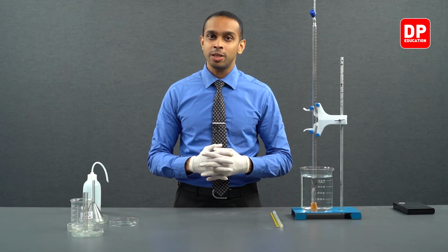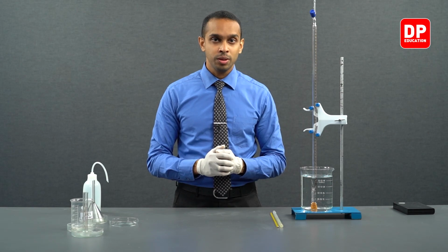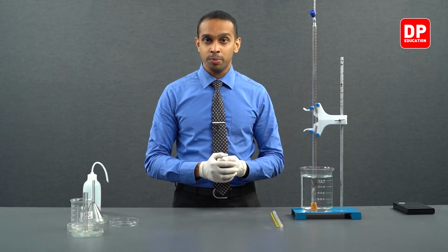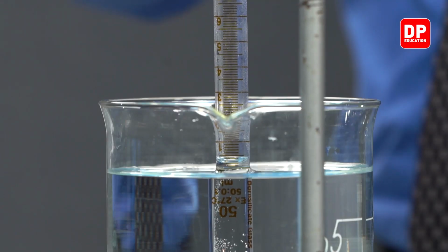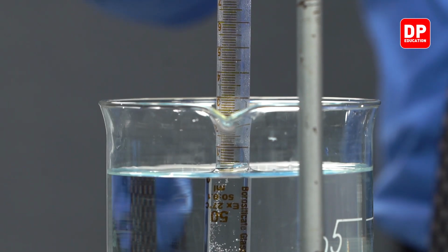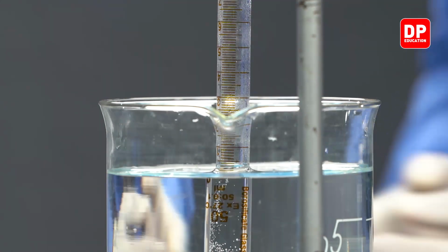Like I mentioned in the previous two trials, this volume is not the correct volume because the pressure inside the burette is not the same as the pressure that is outside of the burette. To make the two pressures equal to one another, we have to make sure the two levels inside and outside the burette align with each other.